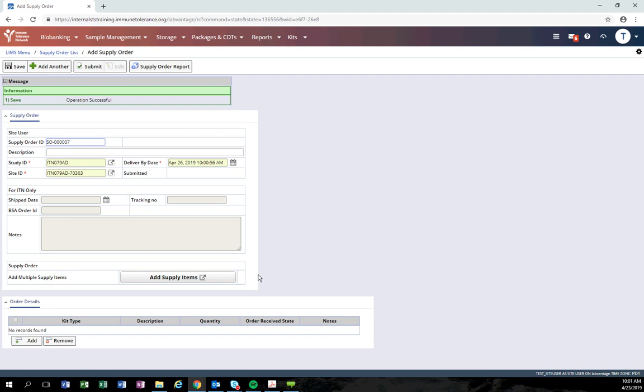If you try to add supply items before clicking save, the system will not save those supply items to your order, so be sure to click save after entering the study ID, site ID, and deliver by date.